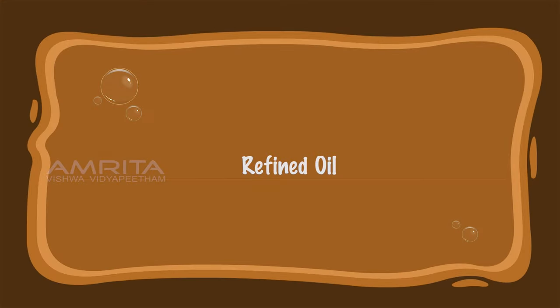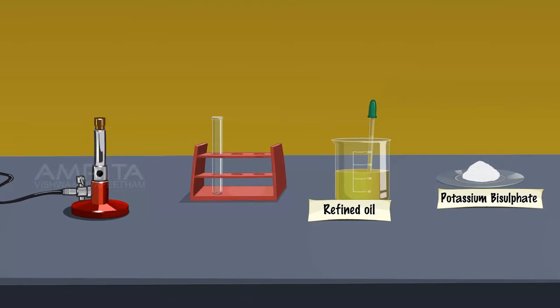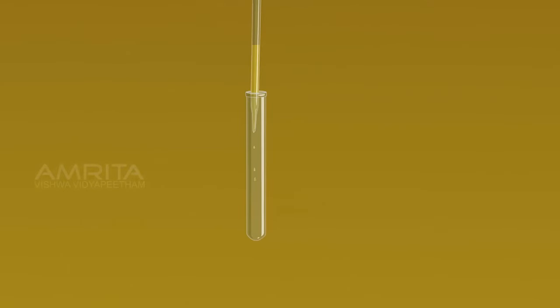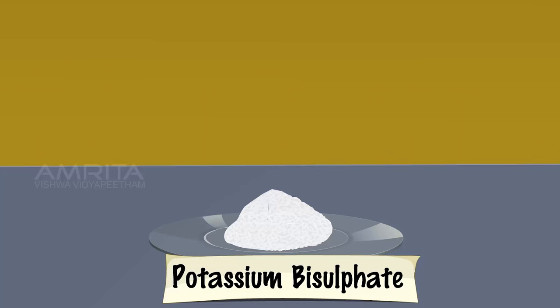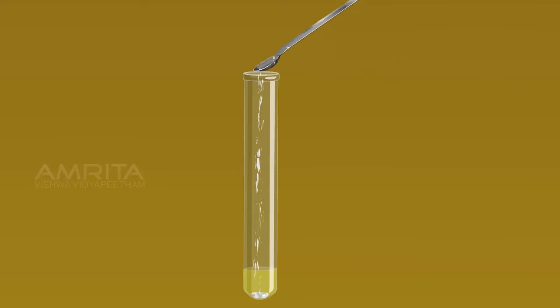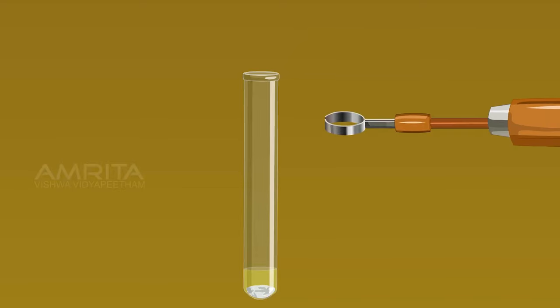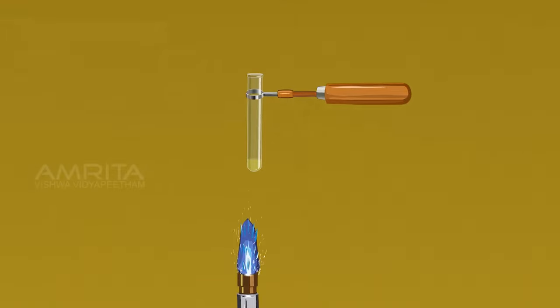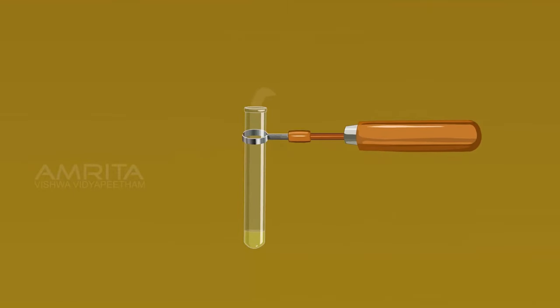Refined Oil. Using a dropper, take a small amount of refined oil in a test tube. Using a spatula, take a small quantity of potassium bisulphate crystals and add them into the test tube. Hold the test tube with the test tube holder and heat it over the Bunsen burner. When fat is heated strongly in the presence of a dehydrating agent like potassium bisulphate, the glycerol portion of the molecule is dehydrated to form an unsaturated aldehyde called acrolein, which has a pungent irritating odour.